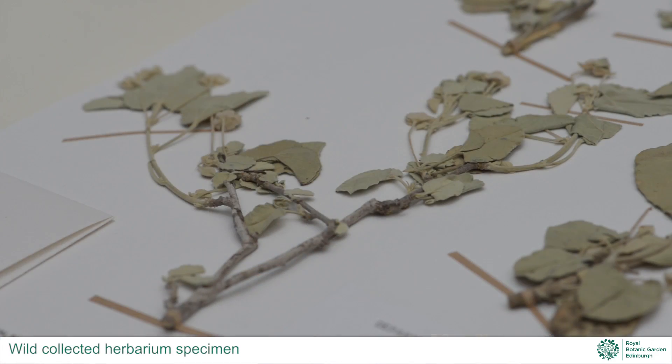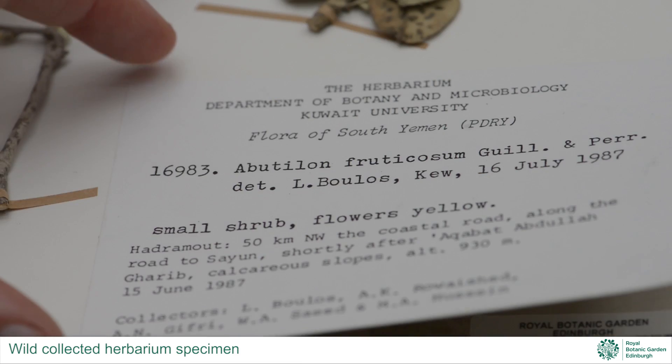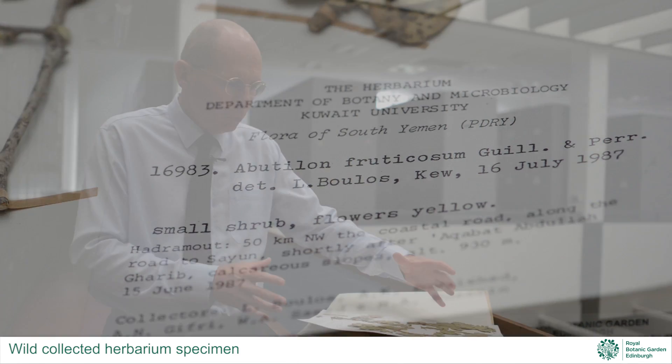The idea behind the herbarium specimen is a very simple one. It's a piece of dried plant with a label containing information about it, and the two are attached to a piece of card. This plant was growing in the wild in its natural habitat and brought here to Edinburgh with the information on the label.